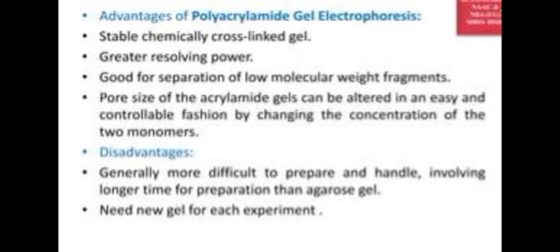Next one, advantages and disadvantages of gel electrophoresis. First one, advantages. First point, stable chemically cross-linked gels, and second point, greater resolving power and good for separations of low molecular weight fragments. Pore size of acrylamide gels can be altered in an easy and controllable fashion by changing the concentration of two monomers.